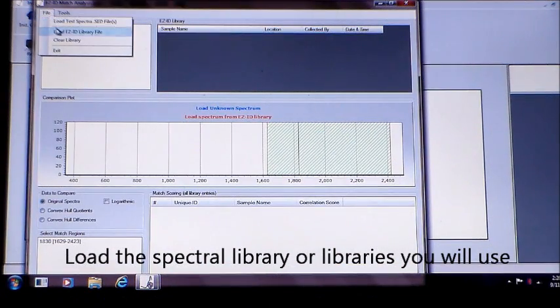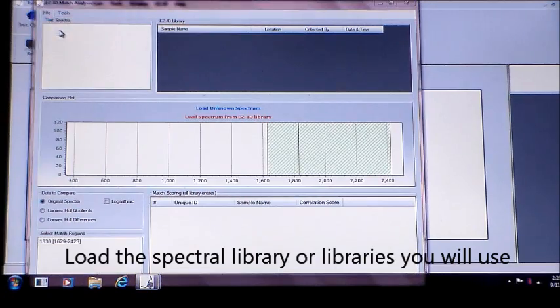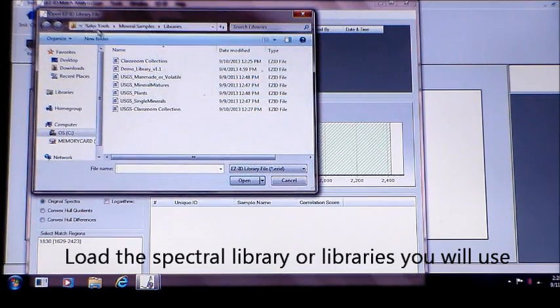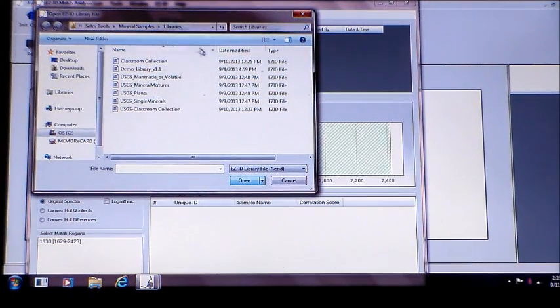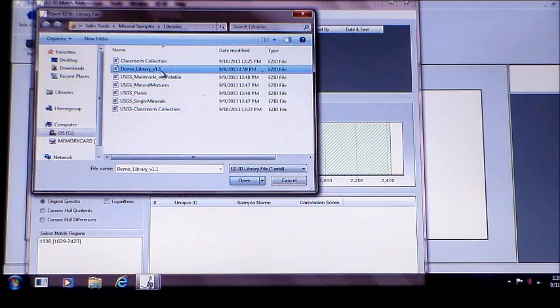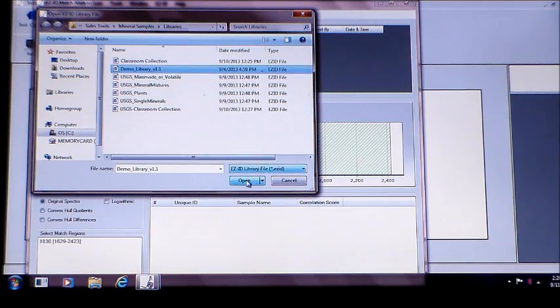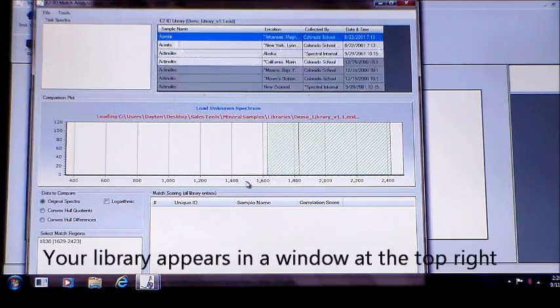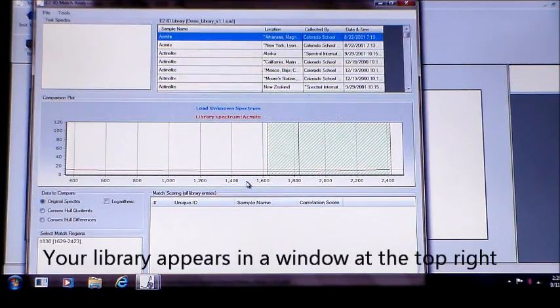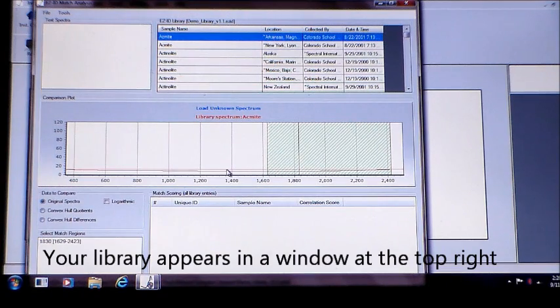Select the spectra library or libraries you wish to match against. Your library appears on the EZID screen.